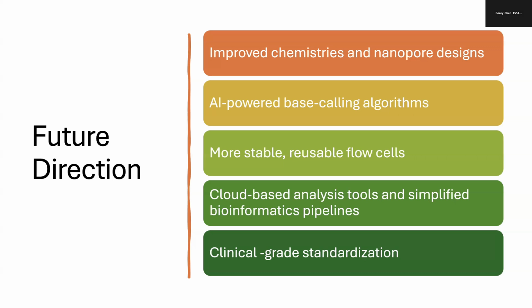In conclusion, while Oxford Nanopore technology is powerful, its limitations in accuracy, cost, and accessibility are real. Fortunately, ongoing advancements are quickly addressing these issues, paving the way for broader use in research, clinical, and field-based applications.